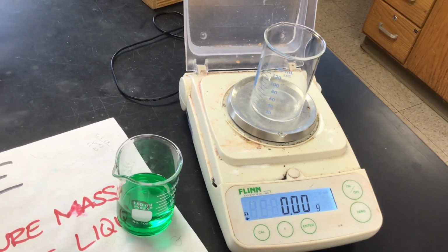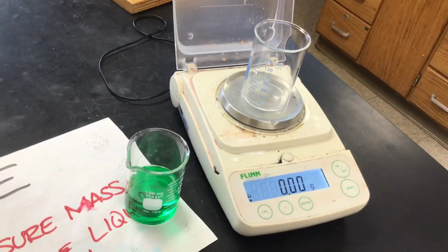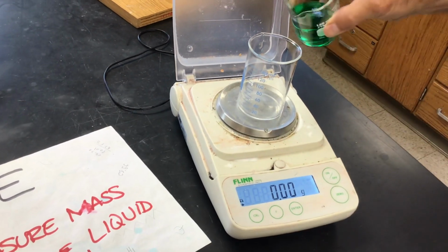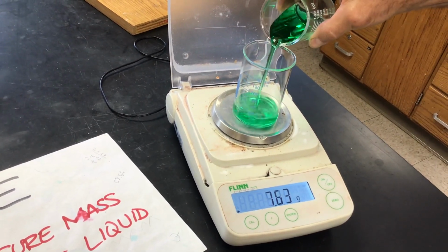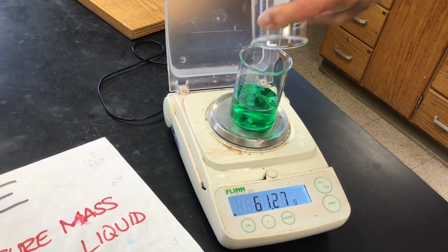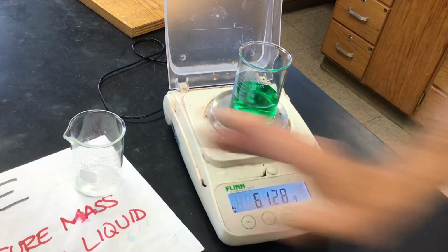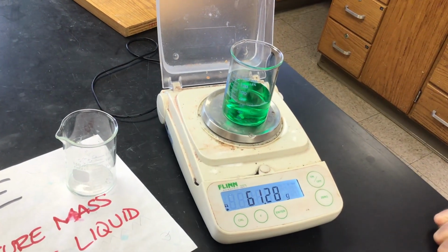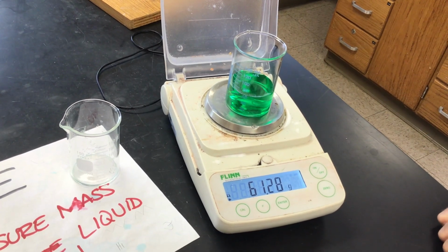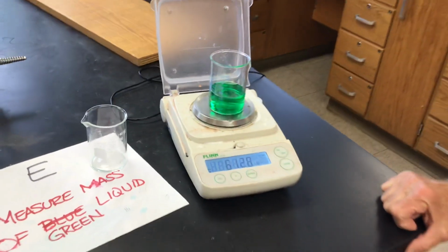Okay, now the balance is zeroed with that beaker sitting there, and then what if we did this? All right. Okay. We got it.